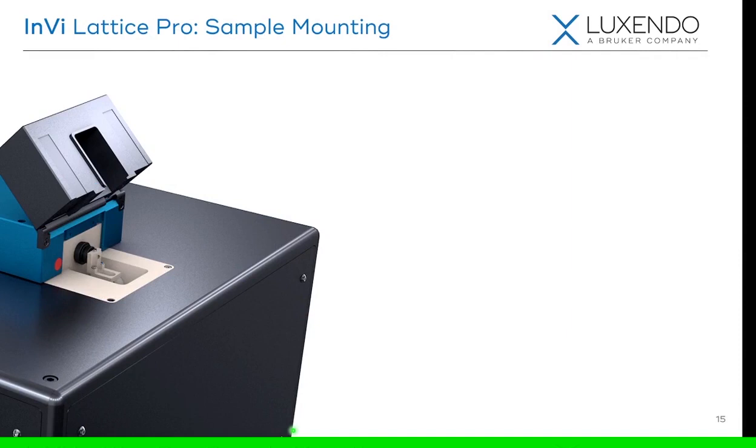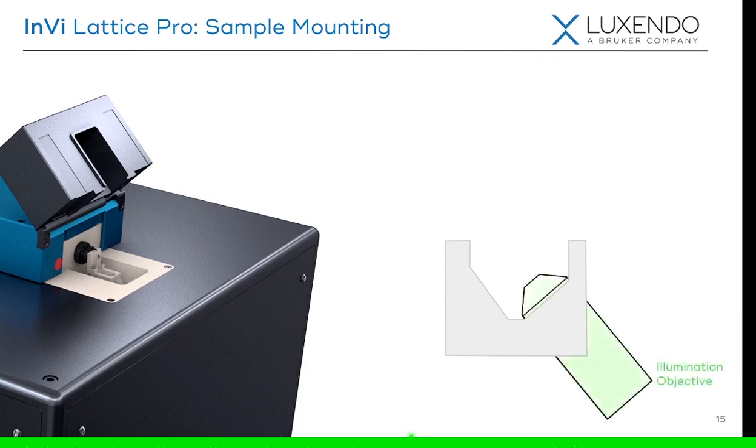So the sample mounting on the Lattice Pro is just slightly different than your standard microscope, and this is because we have water immersion objectives. Here, this is a side cutaway of this portion, and we'll have our water immersion illumination objective and our water immersion detection objective in there. And as I've been hinting, we fill this entire chamber with water, which is how we get an inverted light sheet. However, if we're putting samples into this, most samples stereotypically do not like water.